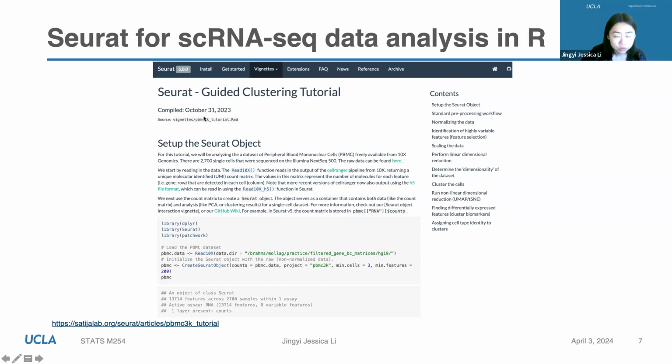Okay, so Seurat defines its own object class in R. So you would need to first create a Seurat object. But basically, the first step is you need to load the data, and this is from the 10x Genomics technology. And 10x is the popular commercial technology for single-cell RNA-seq. So many labs are using it, right? So here, UMI, unique molecular identifier, is what's generated.